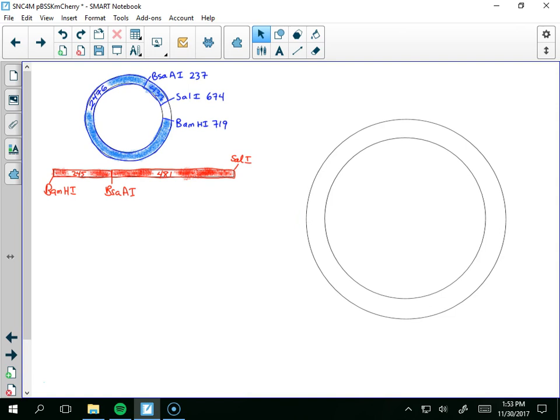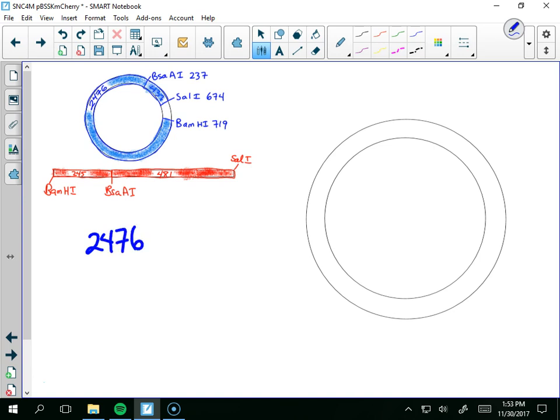So, what's my total size then? 2,476, 437, 481, 245. Let's add those up. 3,639. Yeah.